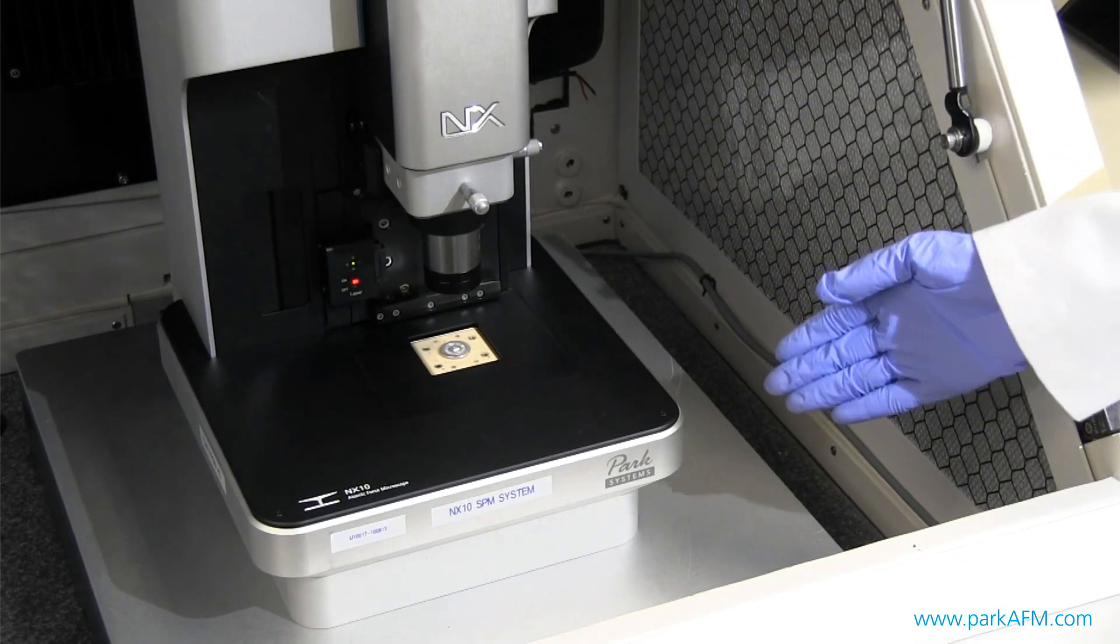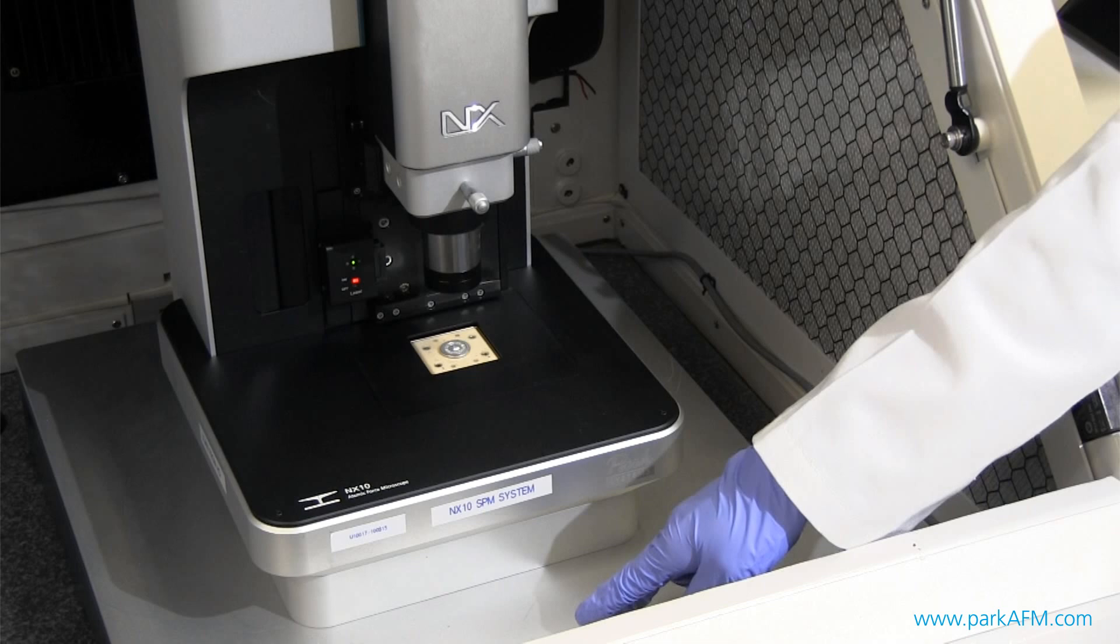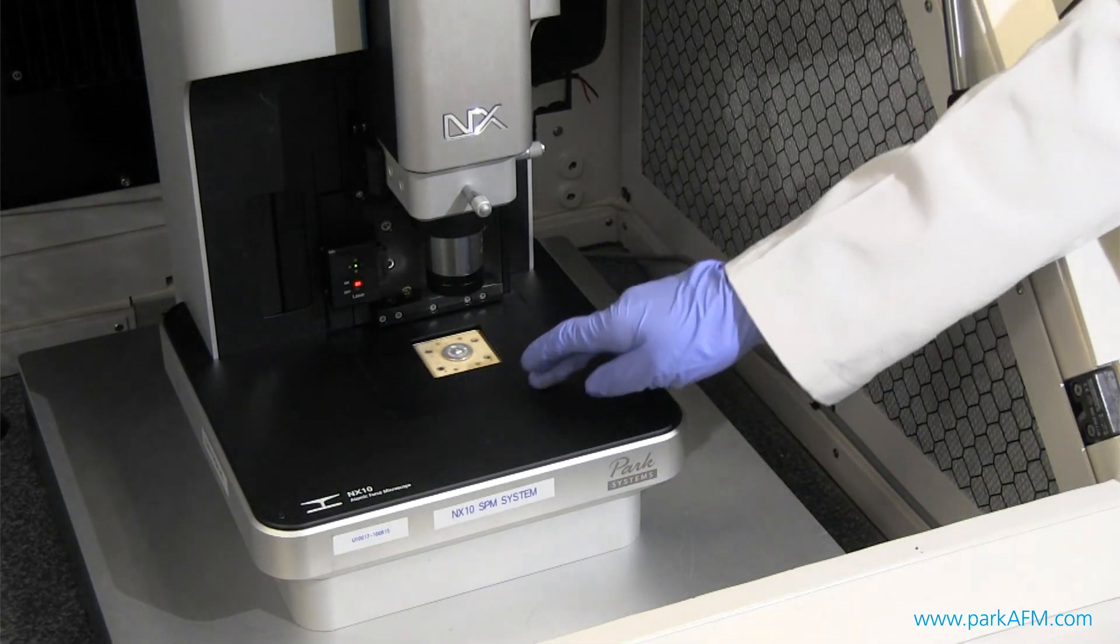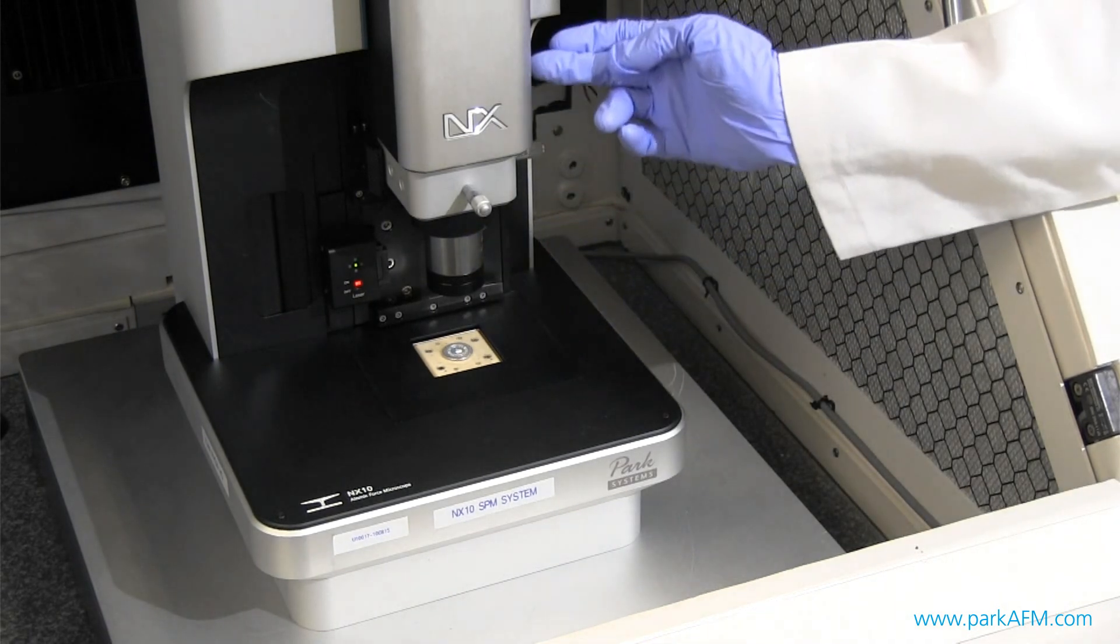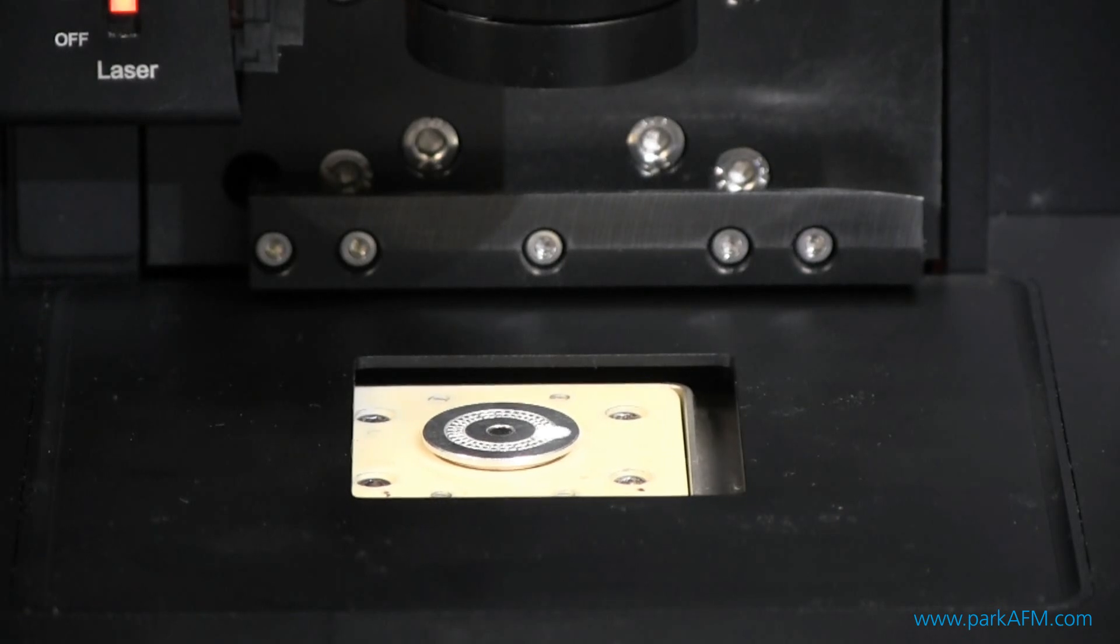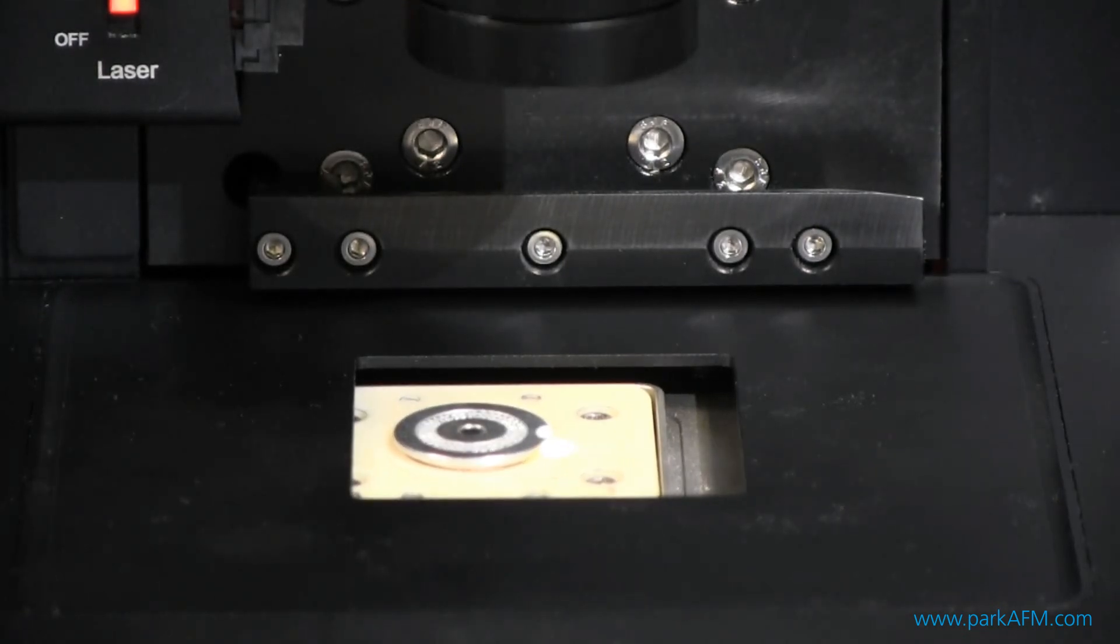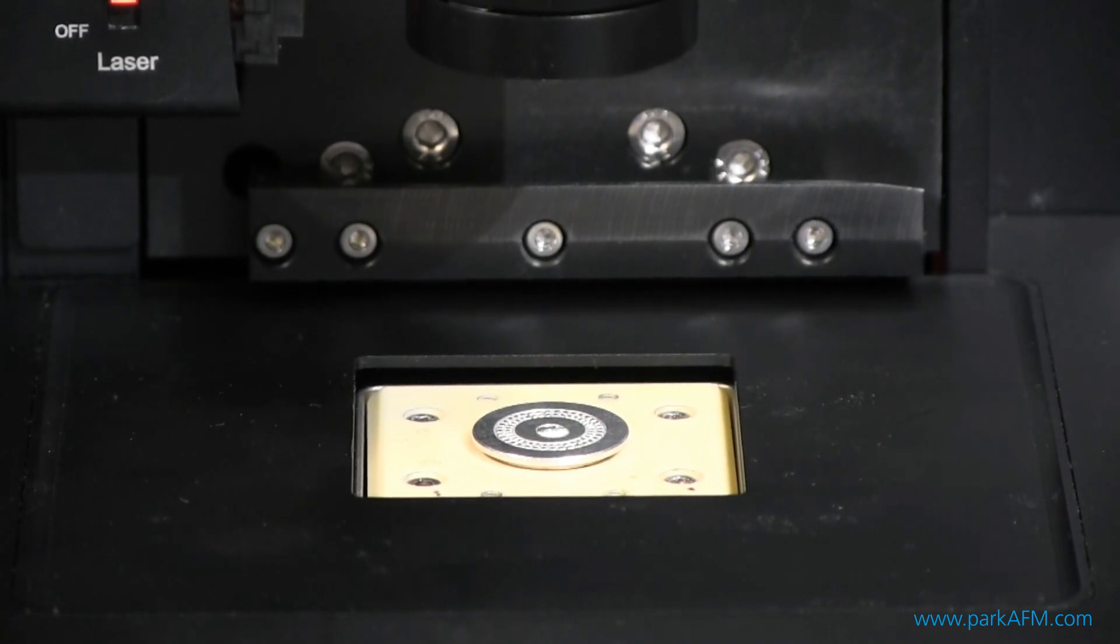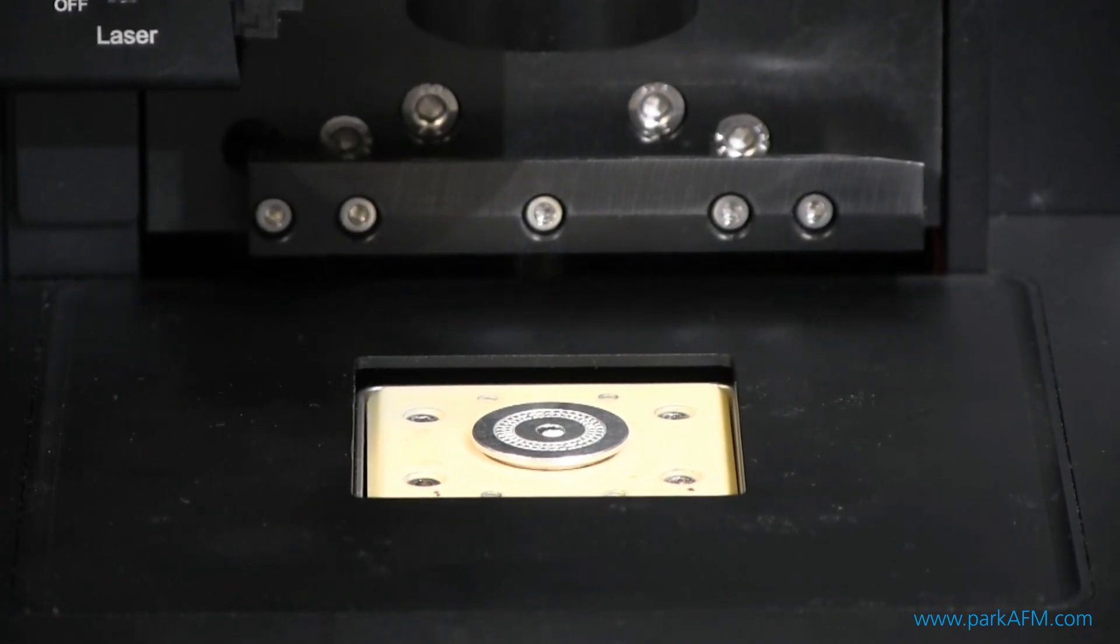So here is the body of the system. Down here is the active vibration isolation table, and here is the XY sample stage decoupled from the Z stage. Since both the XY scanner and Z head are motorized, moving them is as simple as making a few mouse clicks in the system's control software.